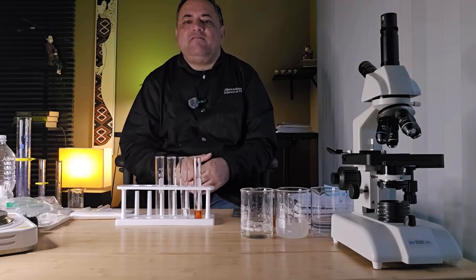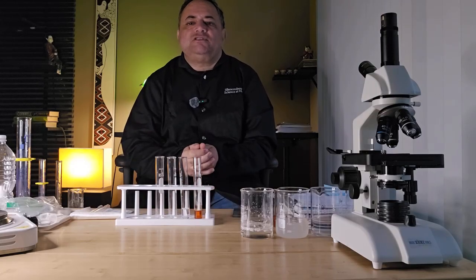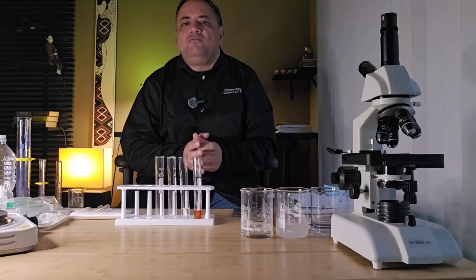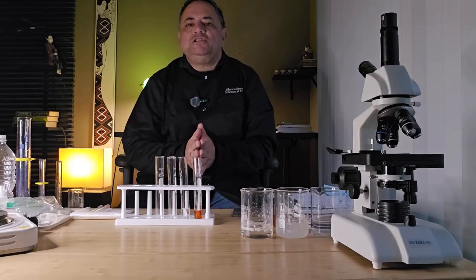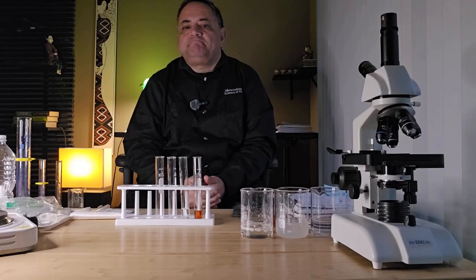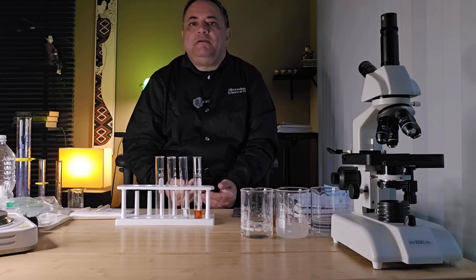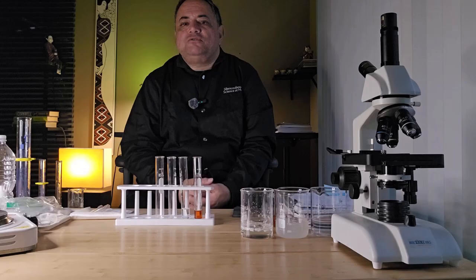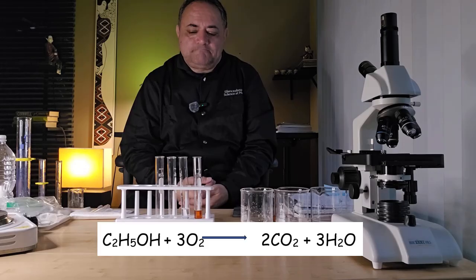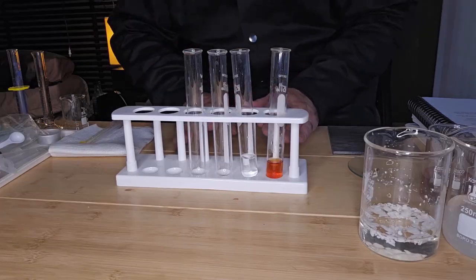And calcium acetate forms a network structure with ethanol, causing the mixture to trap the liquid in a solid-like matrix, forming a gel. The gel is primarily physical and it's reversible with temperature or dilution. And we're going to demonstrate the property of how it can be used as a canned fuel, as an emergency fuel source. So let's prepare the gel. Move on to making the gel.